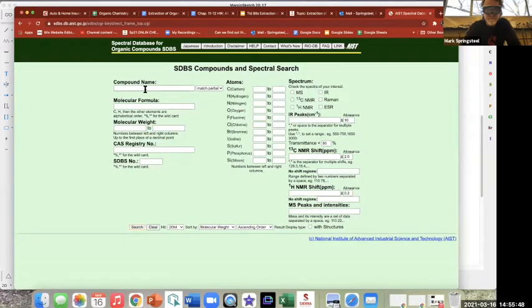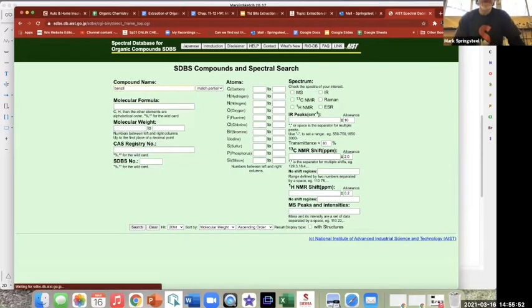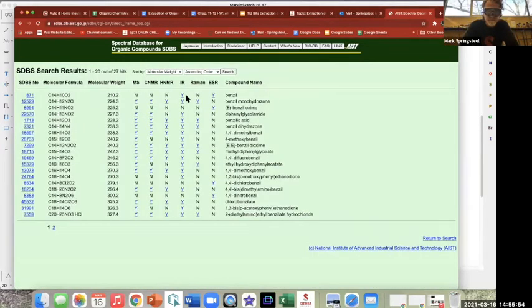I'll share my screen with you guys too. Are you guys hearing me okay again? You said the molecule was benzil? I don't think it is. I think it might actually be benzil mixed with something else.